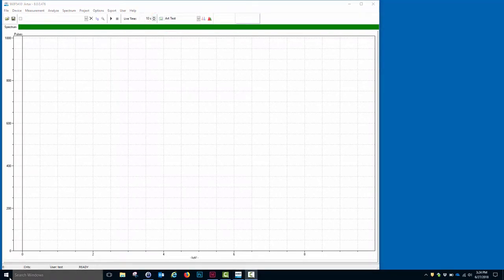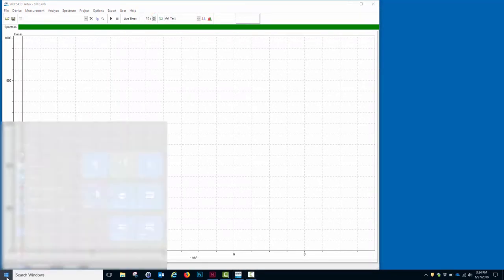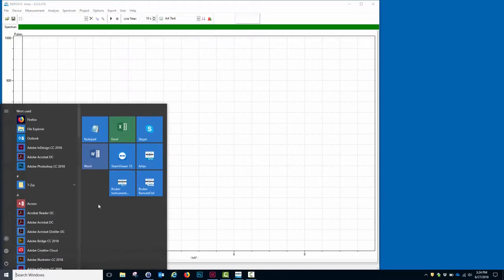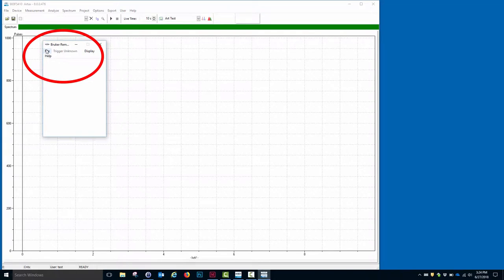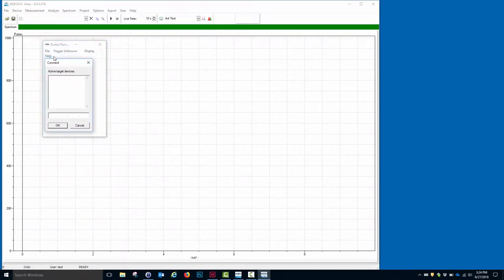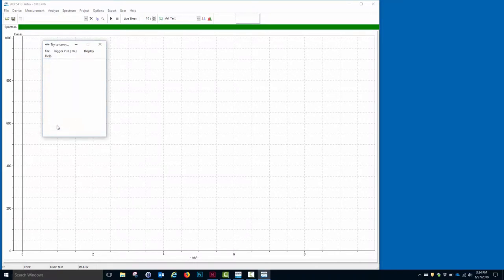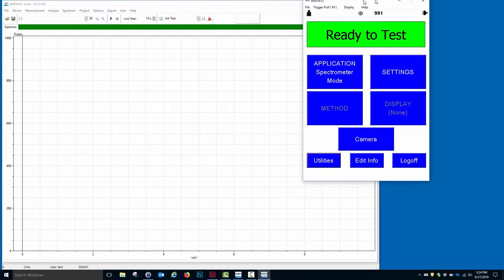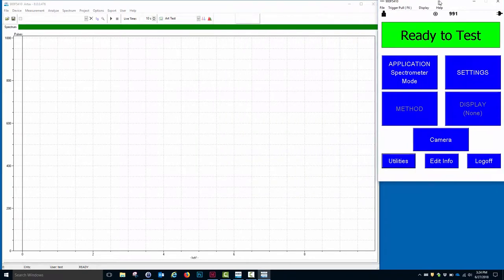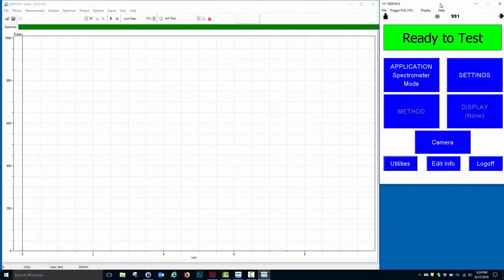Next, I want to start the remote program. Again, I do this by clicking the appropriate icon. And when the box comes up, I go to File, Connect. Again the instrument number will show up, and I click OK. After a few seconds, the image of the instrument screen will appear on the remote control, and I'll move it over here.